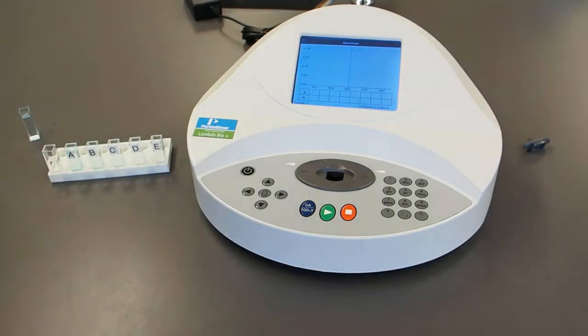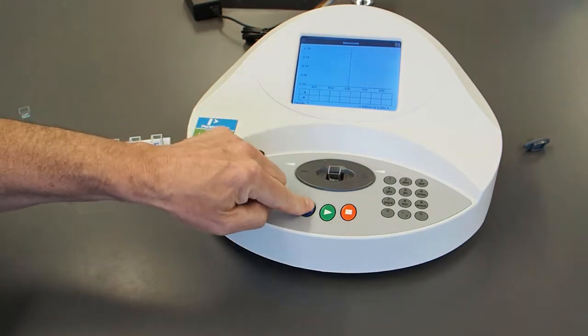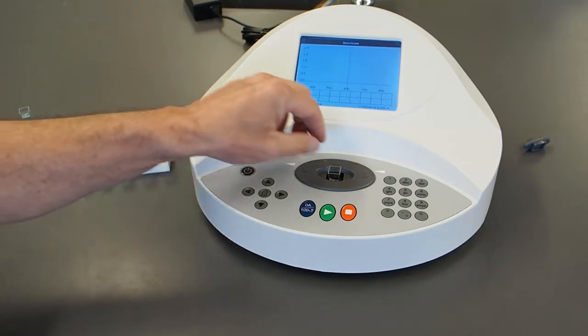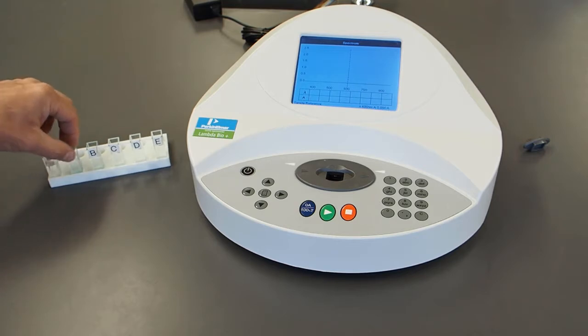Okay, so what we can do is first measure the spectrum of a solution to find out what wavelength to use. The first thing we're going to do is zero the spectrometer by putting in the blank. Now we're going to look at our most concentrated solution of our standards.